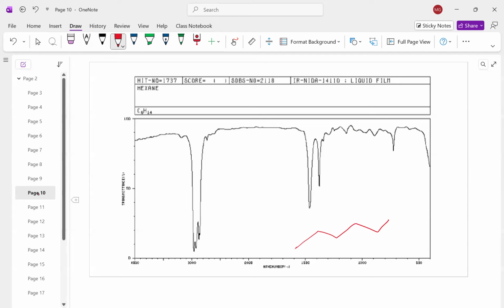So if I look at the IR here, I'm going to start in my hydrogen region. Okay, so there's my hydrogen region. I've got one main signal here, and that's what a typical sp3 carbon-hydrogen signal looks like. And these other things around 1500-ish are going to be our carbon-carbon single bonds. I don't really care if you label those or not because most organic molecules have a carbon-carbon single bond in them. There are some that don't, but you're going to see that signal over and over again.